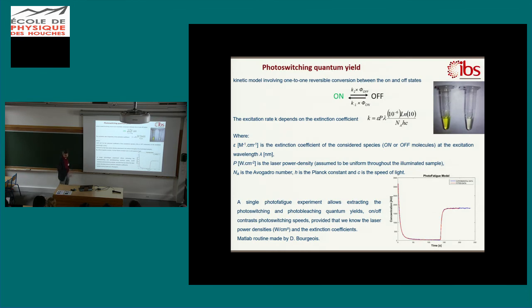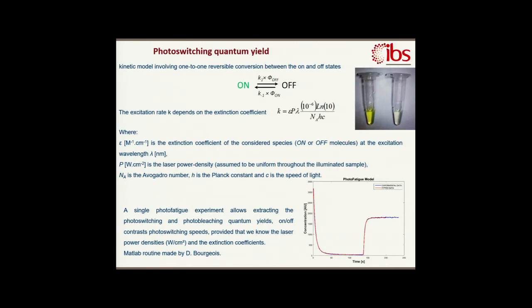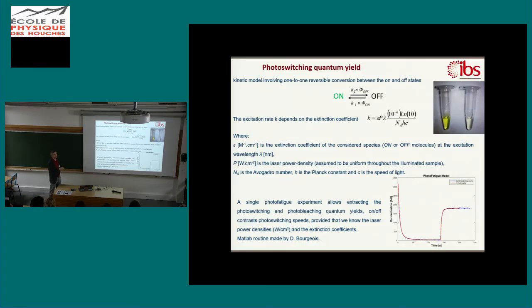And since the bleaching can occur, that you saw on the previous slide, here that's bleaching, it means that you're able, with a single photofatigue experiment, to extract the bleaching quantum yield, bleaching speed, and the on and off quantum yields of switching as well. So you need for that to precisely know the concentration, so it means the extinction coefficient of your protein, the extinction coefficient of each state, the power densities of each of your lasers, and that's it, I think. Yes, and you can extract all these values.